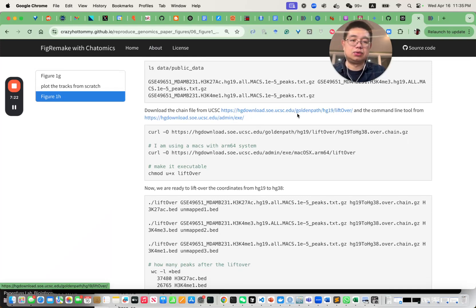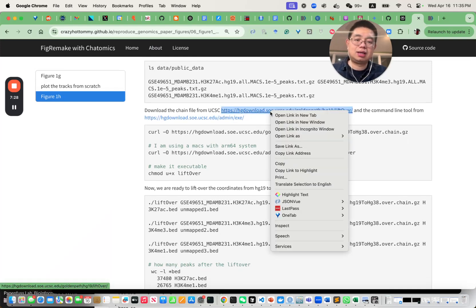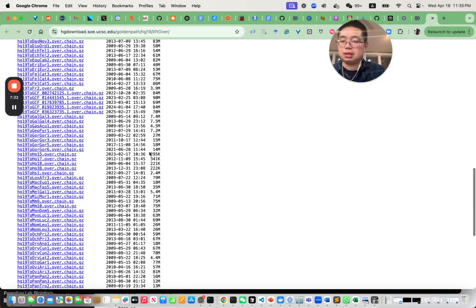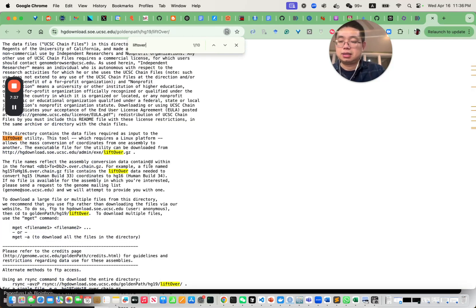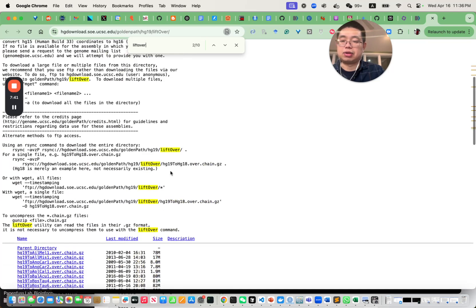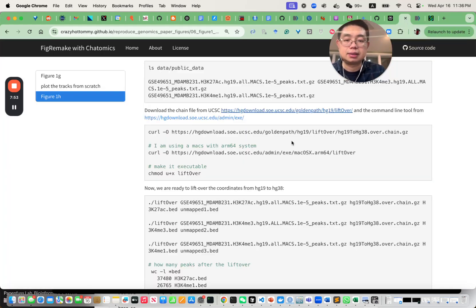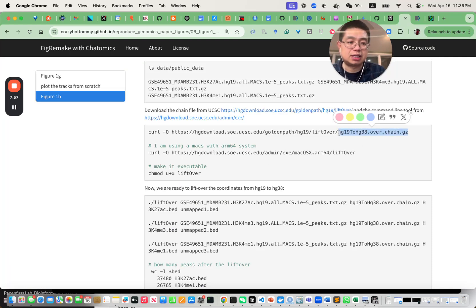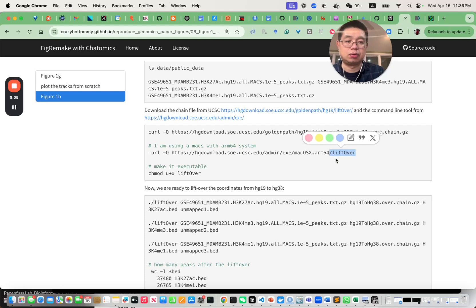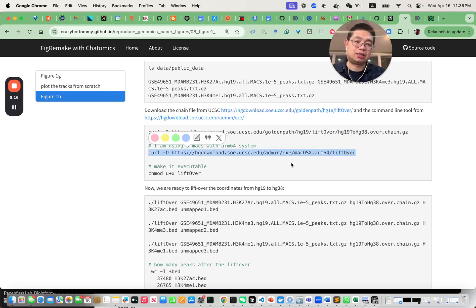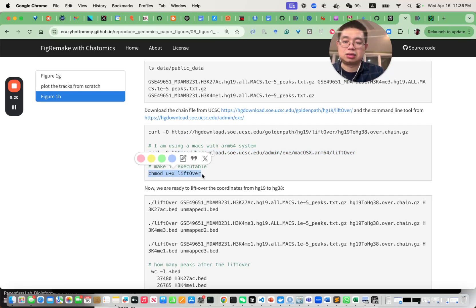To do that, we use a tool called LiftOver from UCSC. You also need to download the chain file, which maps regions between the two genome versions — HG19 and HG38. This is the chain file HG19 to HG38 that you need to download. You can then download the LiftOver binary executable and make it executable using chmod u+x liftover.